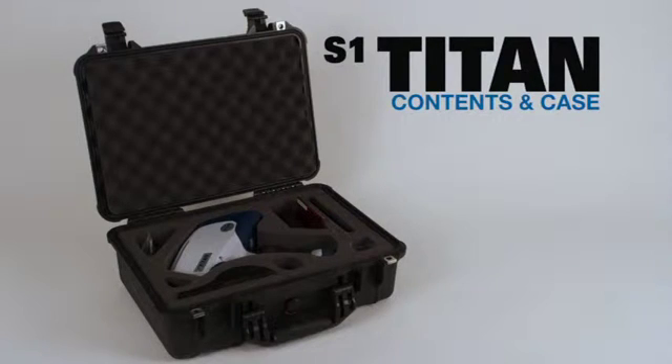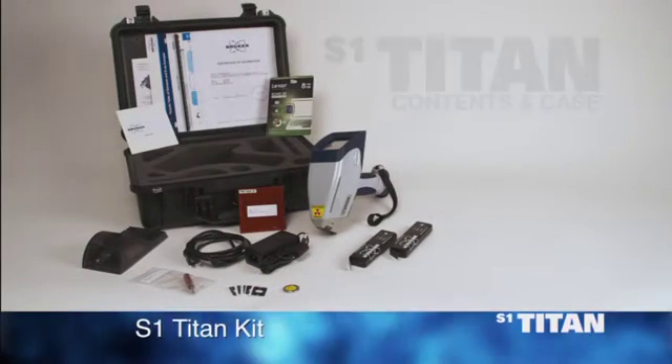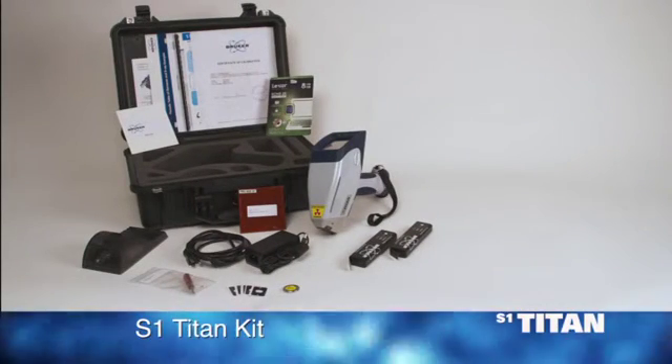The unit comes in a watertight Pelican case. Always return the analyzer to this case when it's not in use. In the case, you will find the following items.